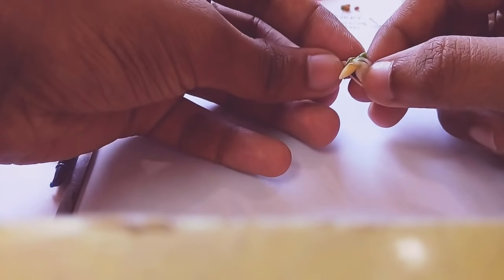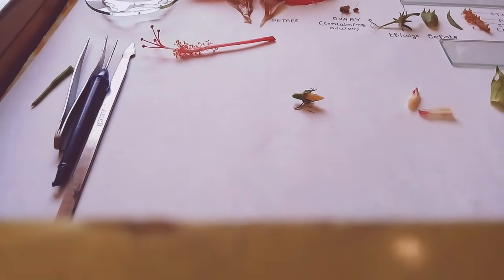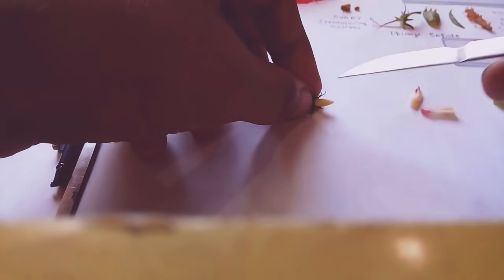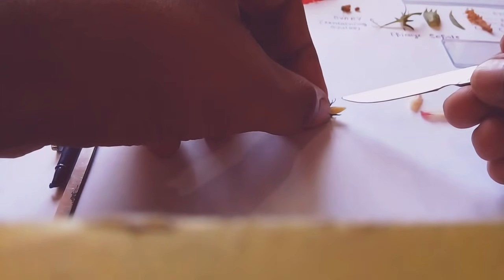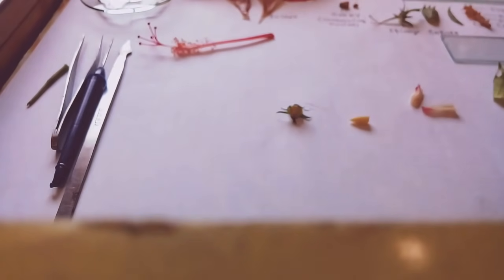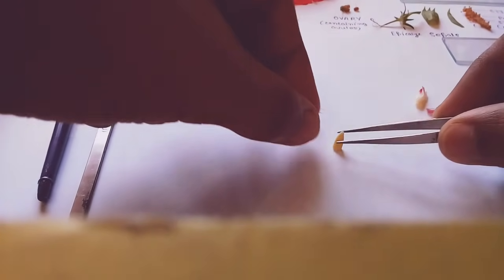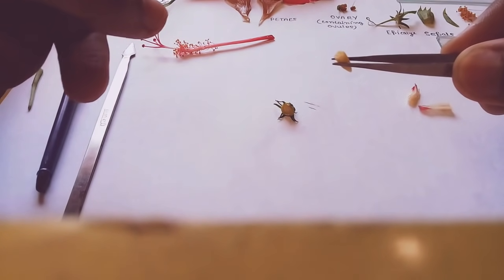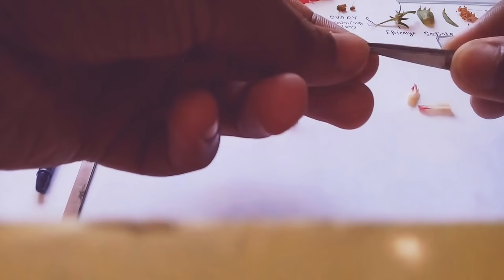You can see the ovary part here — this is the ovary. So we have to remove these parts. What you see here is the ovary, and the ovary is filled with numerous small ovules. Let's split open the ovary — you can either split it open or cut the ovary and squeeze the ovules out.